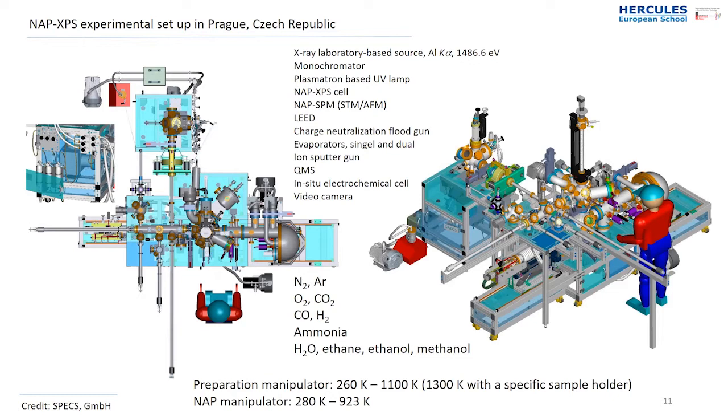So this visualization is quite important during the measurement, and you will see it real soon. We have a couple of gases. We have pipelines. We can combine those gases together. There are 3 flow controllers from one side. We have also another 2 lines going in for operating the vapors from liquids like water, ethanol, methanol, and others.